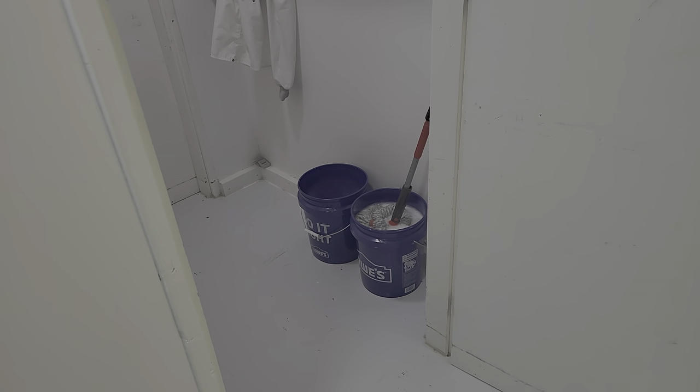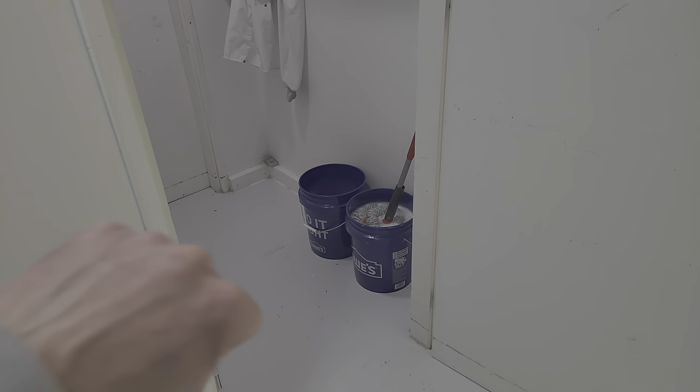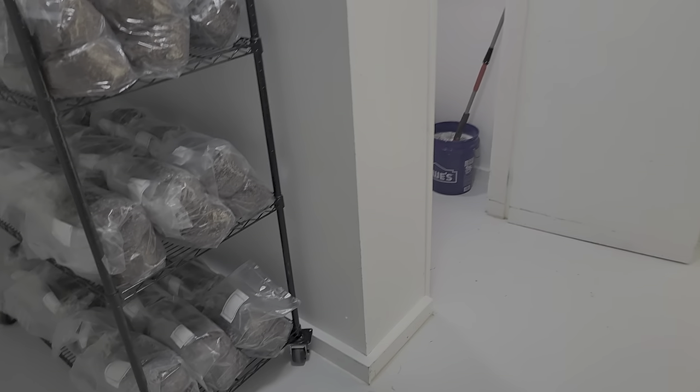We'll rinse in one bucket and mop in the other. These are all sanitizers — we use quaternary ammonia, Star Sanitizer, mixed with Lysol solution or Pine-Sol solution, or Mr. Clean, which we use pretty often. I don't use any bleach at all.